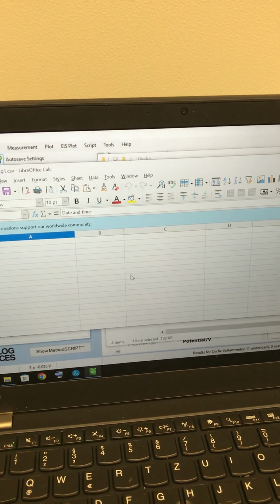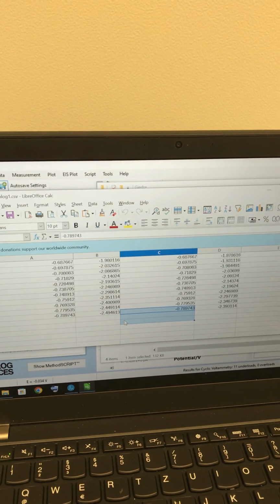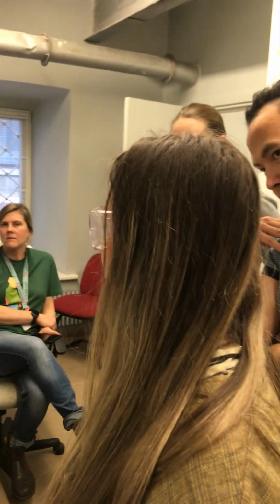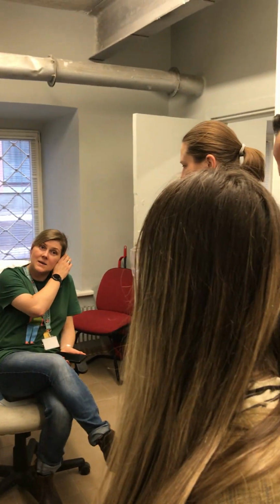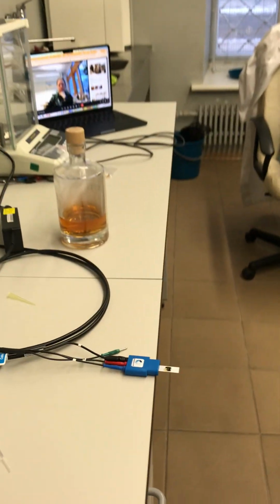So I can barely see, like there is a very strong oxidation and reduction process, but I really need to do more controls to understand which material this is. Usually it's based on the published literature, what we can see, and controls from other samples, other drinks would be required to say more. But this we don't have adequate similar recipes, distillery practices, and might not have a modern reference.